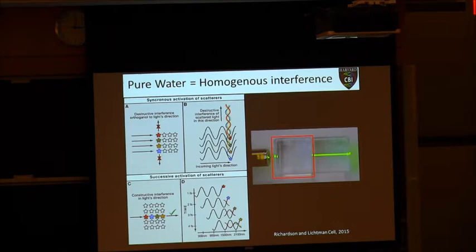It's going to be a destructive interference, and that light is no longer going to be able to travel in that pathway. Okay? That's what's being shown here: all these stars, as they scatter light going straight up, that light interferes with each other, and we get this destructive interference. And this actually holds true for any direction except the forward direction.